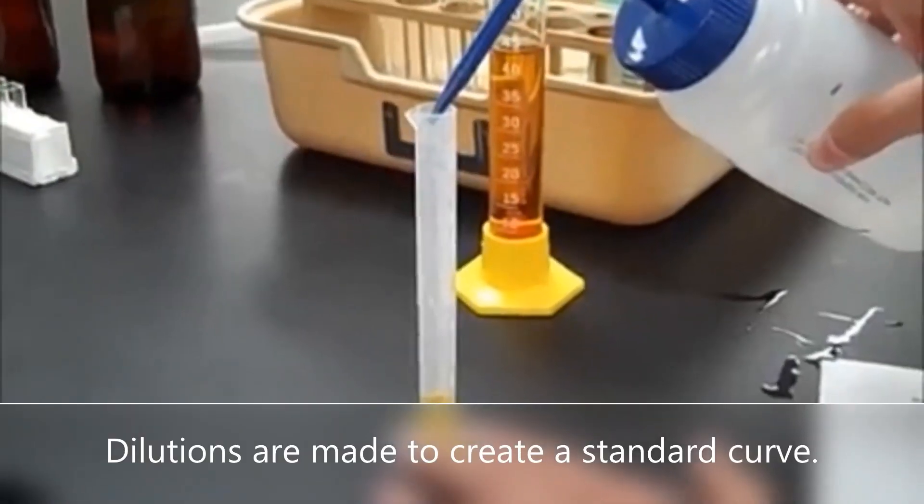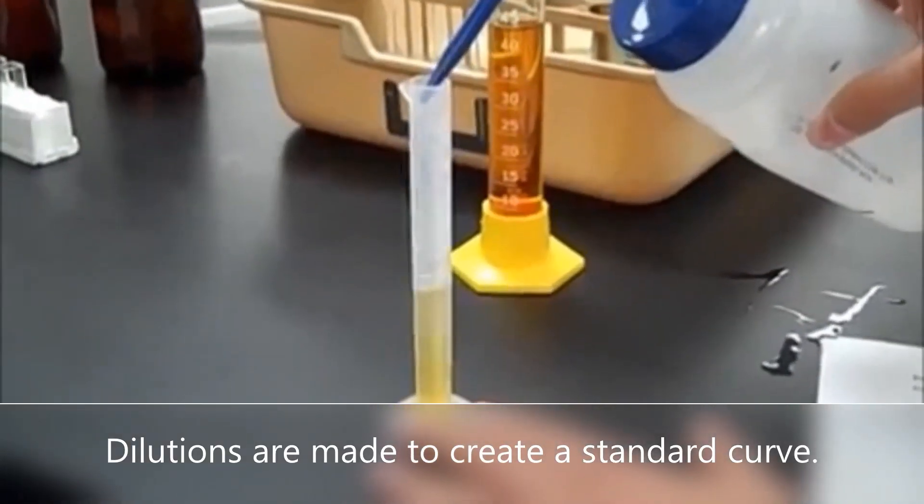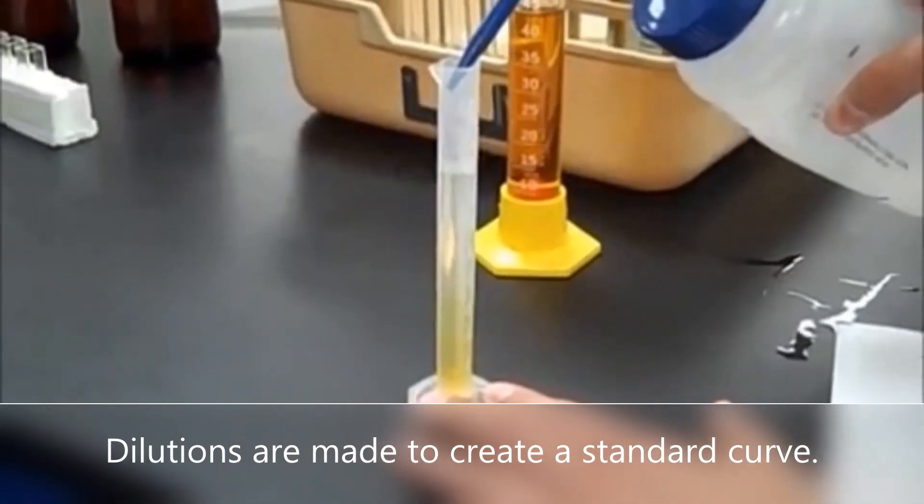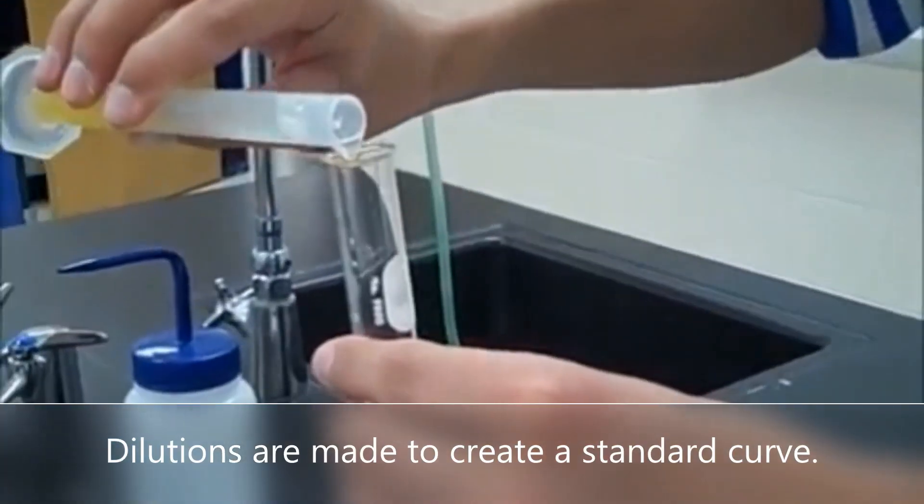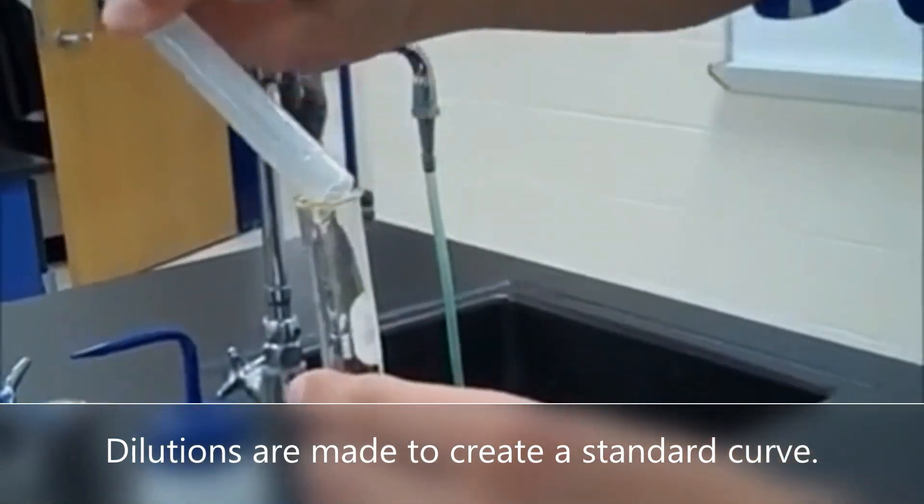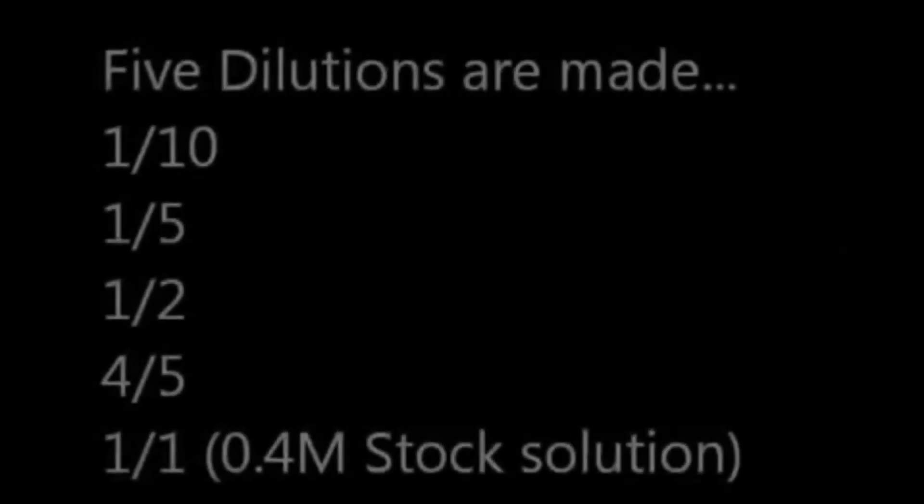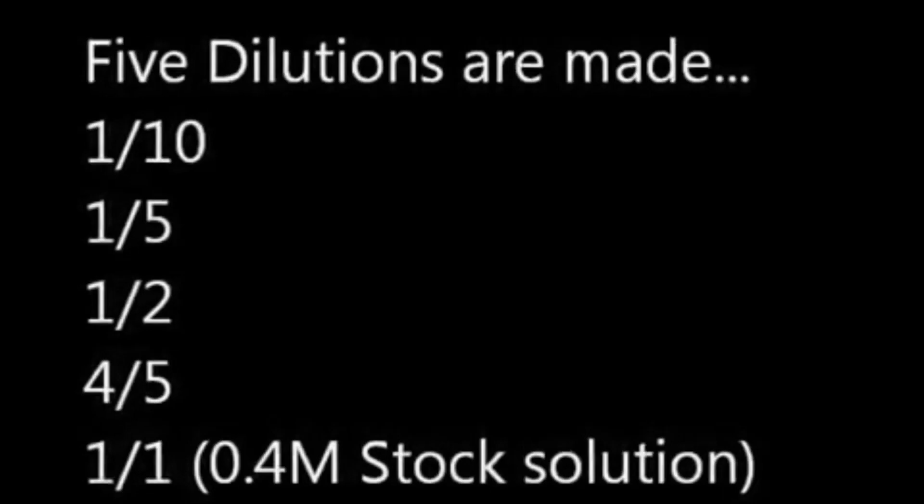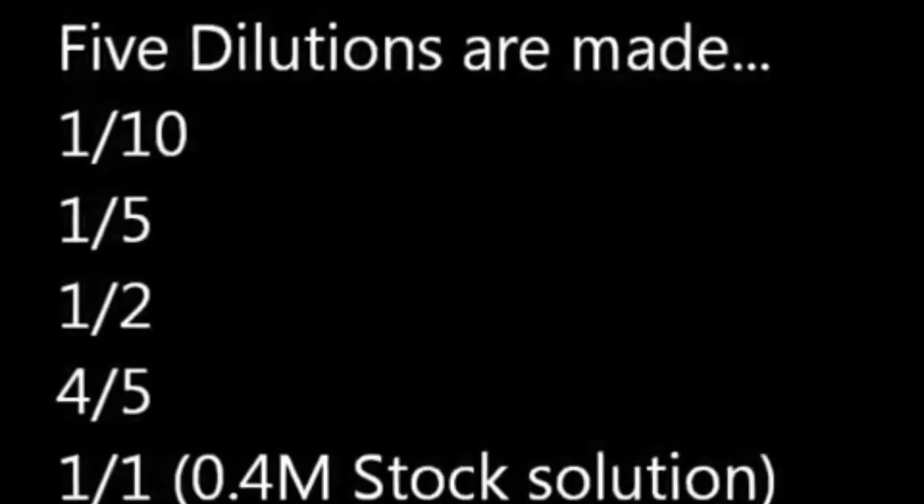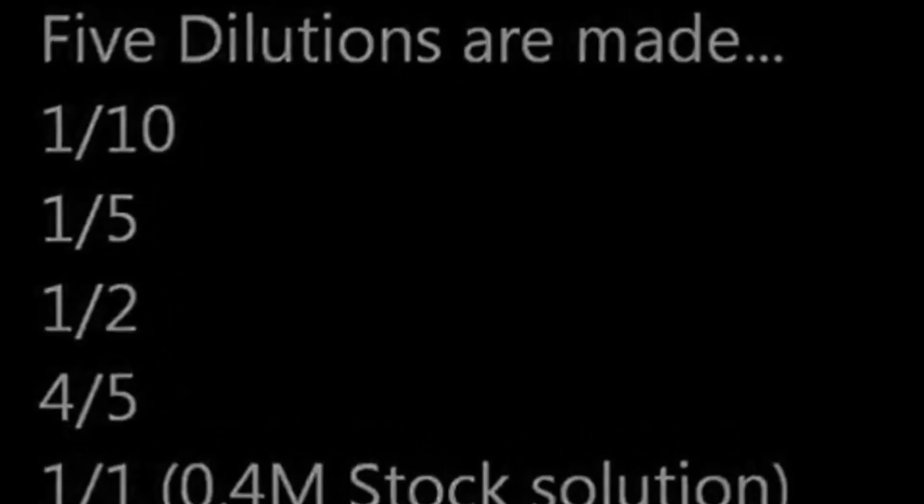A one-tenth dilution is created by diluting one milliliter of stock solution to a new volume of 10 mils. I'll add a link to a video which discusses dilution calculations. Five dilutions are created to give samples of 0.04, 0.08, 0.2, 0.32, and 0.4 molar iron chloride.